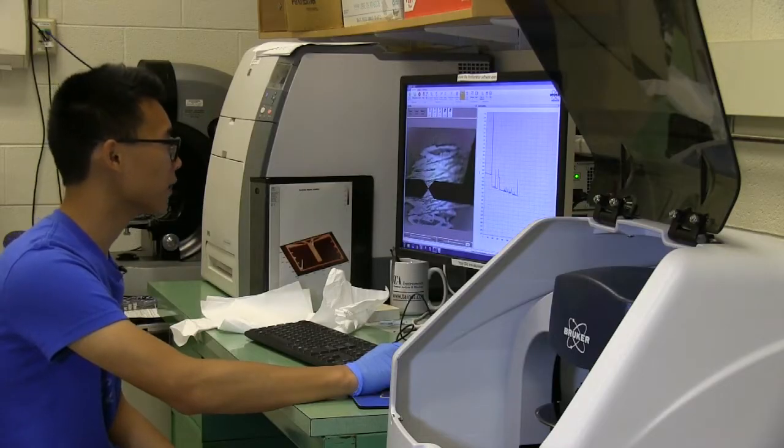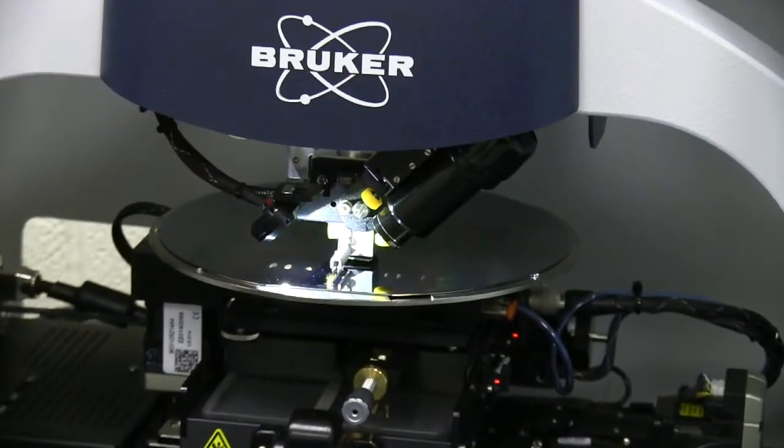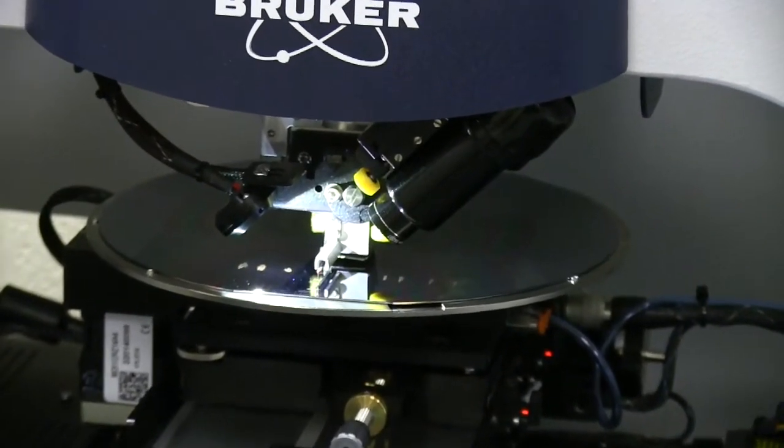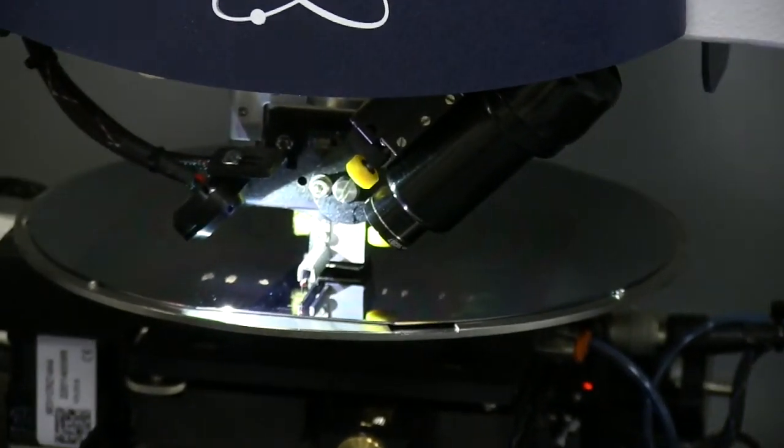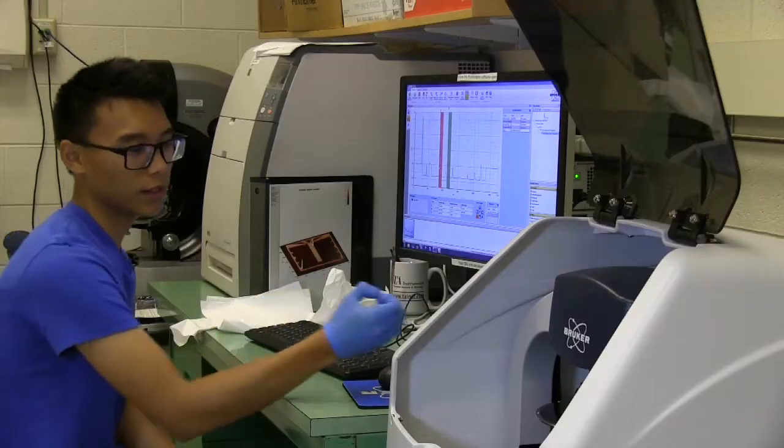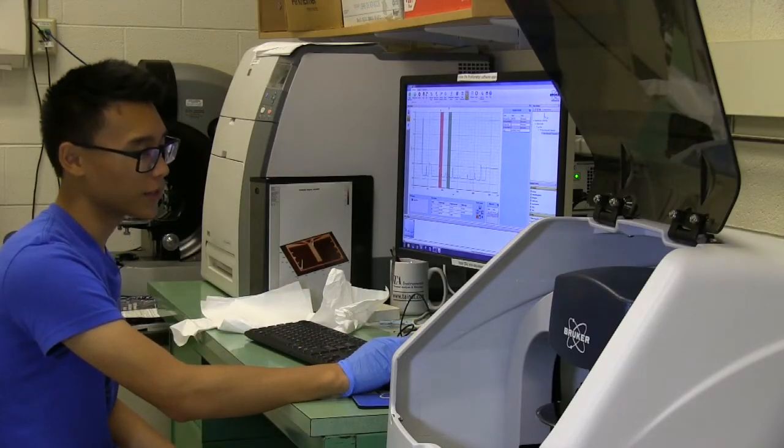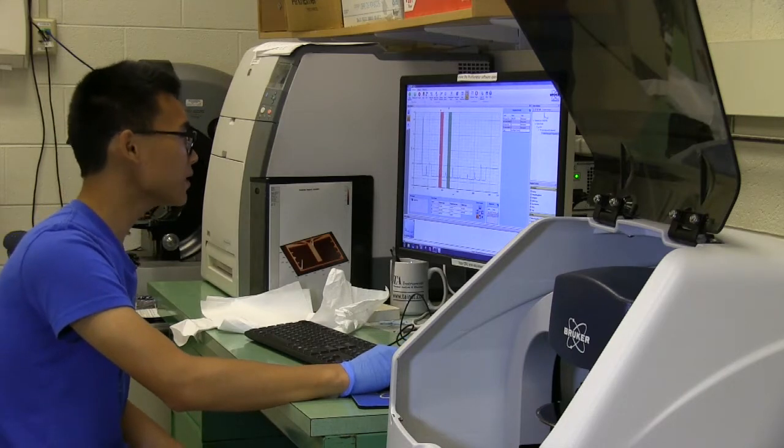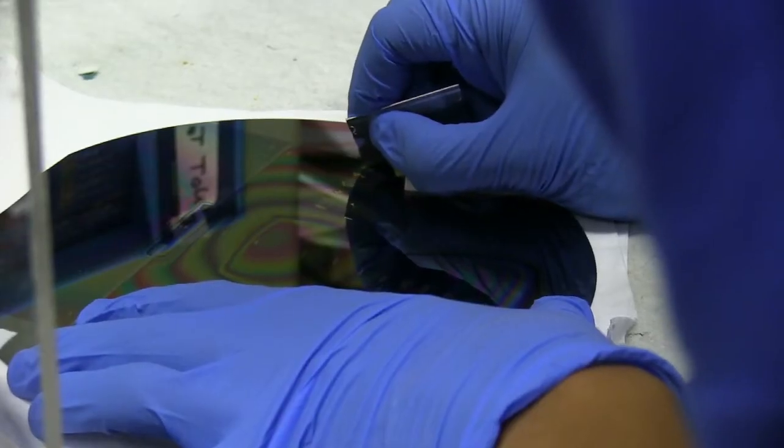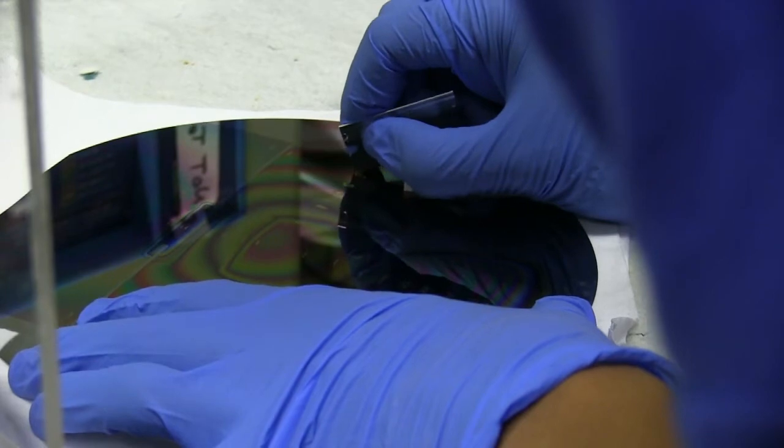All the measurements are done on this software here. Pretty much all you have to do is move the stage around so that the needle is in the right general position, and then set the start and end points which will be before and after the scratches that I made.